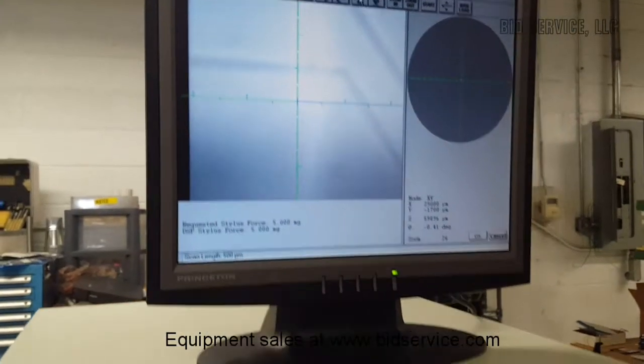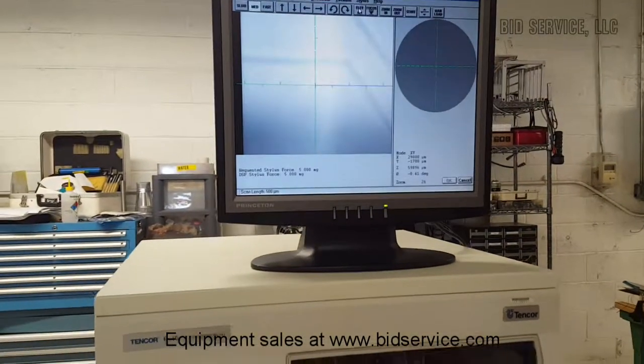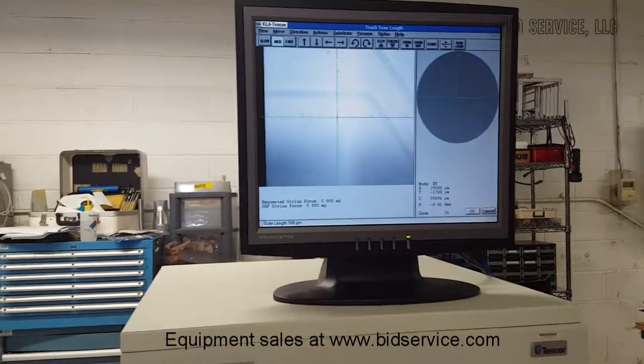Going to go to another sample here, which is a different range.